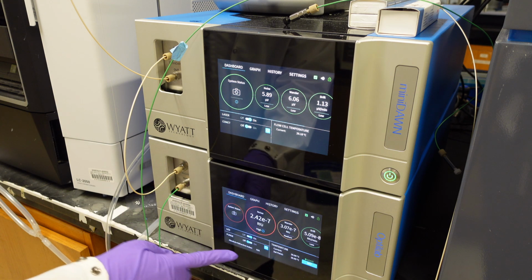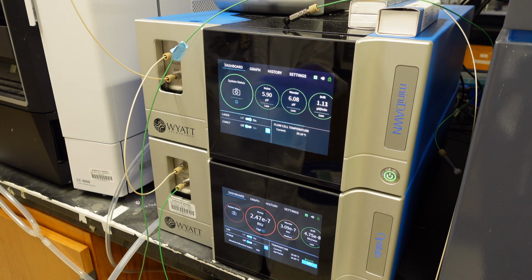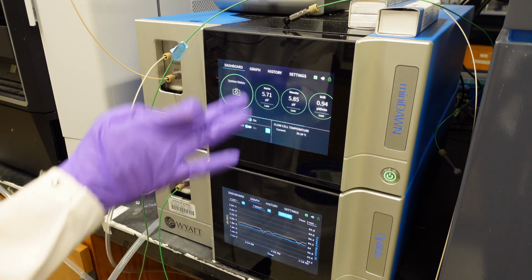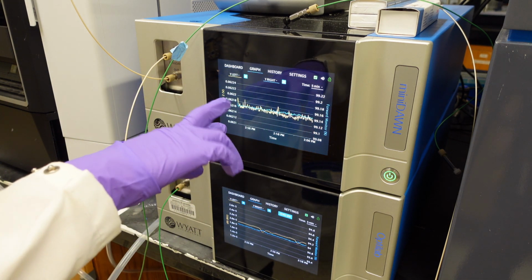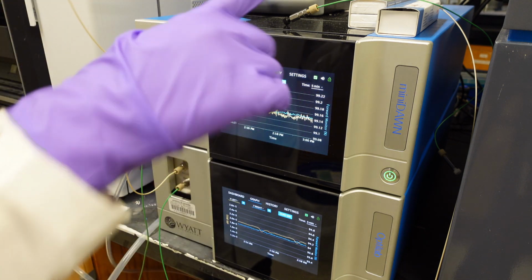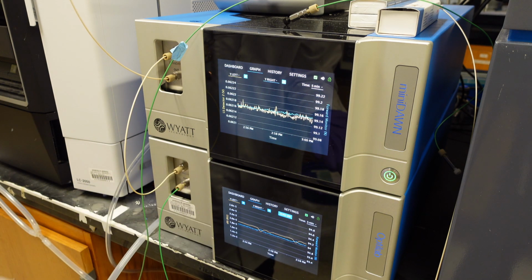And then for here, you also want to make sure that the purge is also on for at least maybe an hour just before you run your sample. And then one way to check is, if we go to the graphs for both of these, when they're both pretty much close together and flatline, and they're not jumping up and down a whole lot, these bumps, not the greatest, but it's okay. Then that's a good sign.